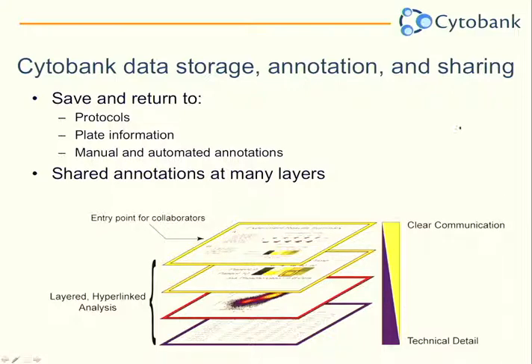And really, kind of looking at the different layers of analysis. At the bottom, you have the raw data, and then you have your 2D plots, but also your summary plots and statistics. The idea is that if you ever change a gate or something in a compensation matrix, this gets reflected in your final figure, and you don't have to worry about all of those steps in between.